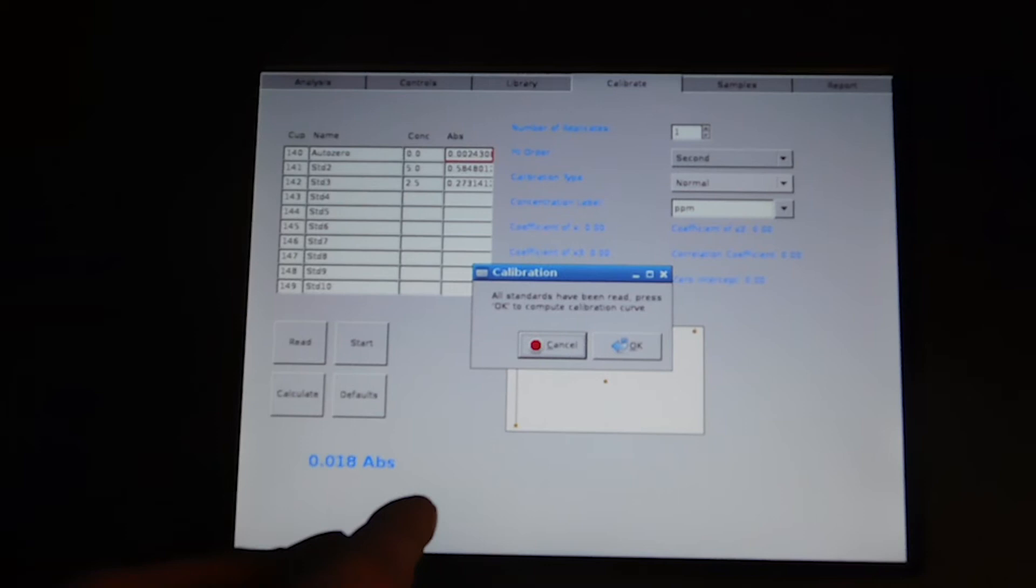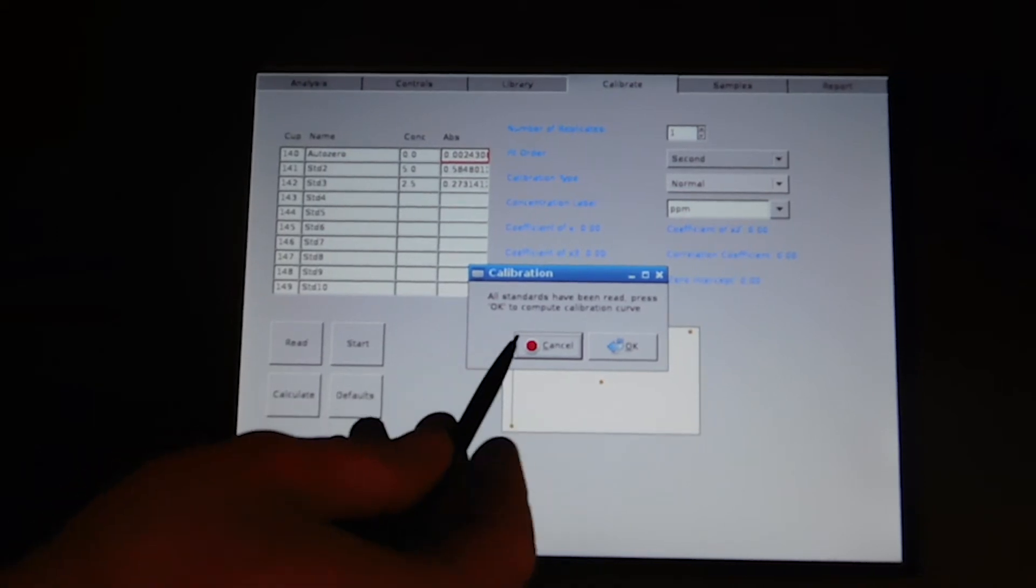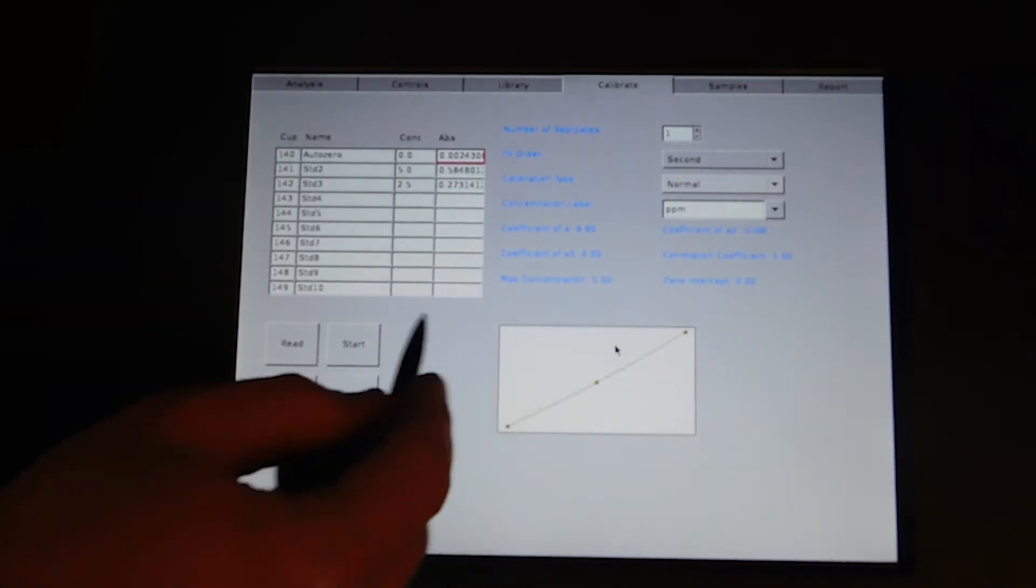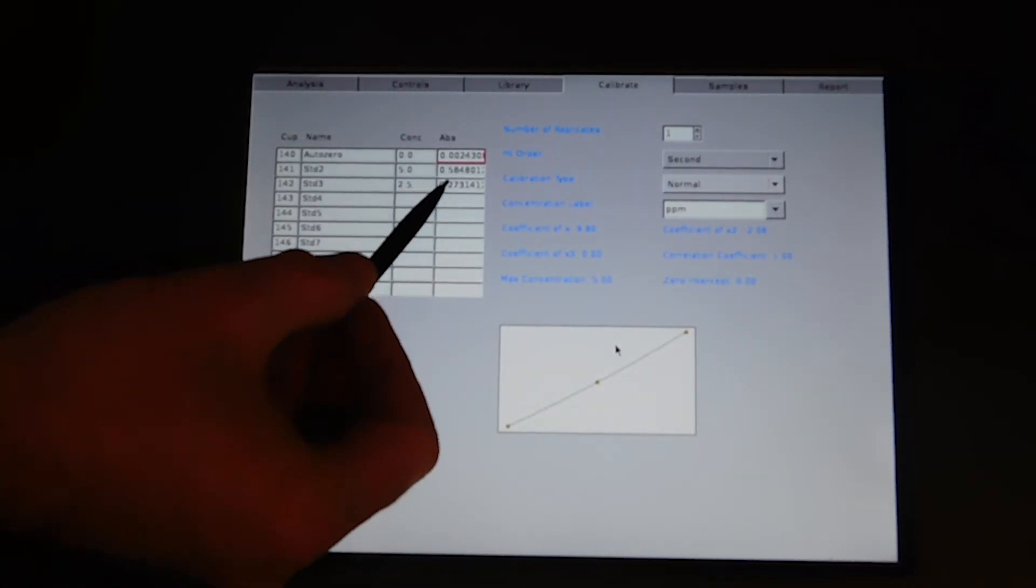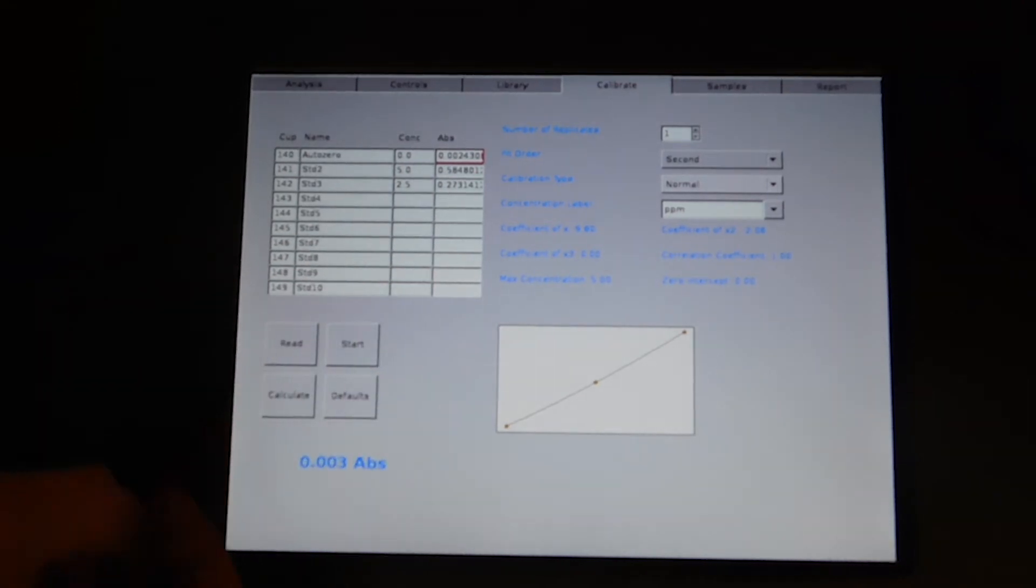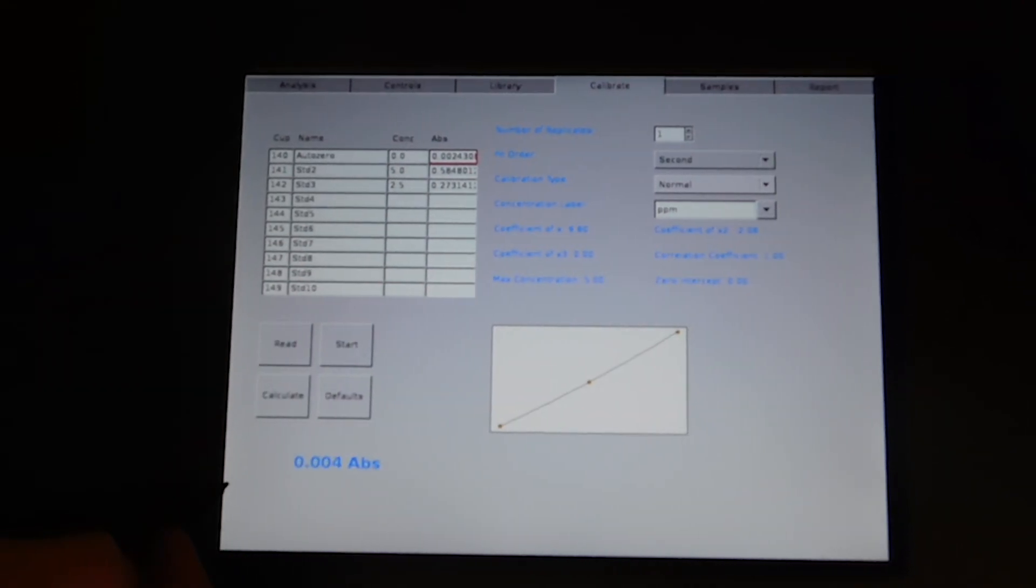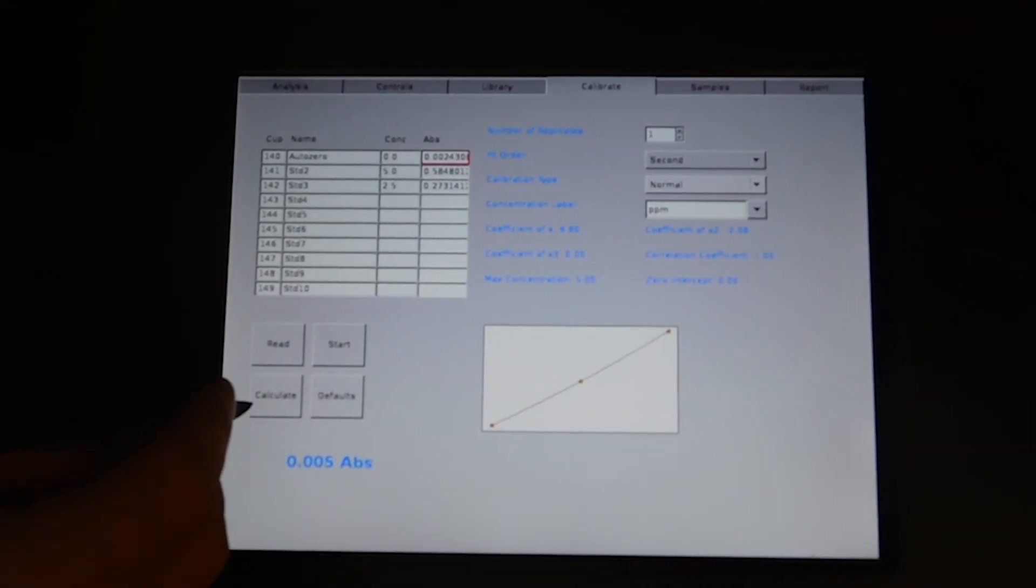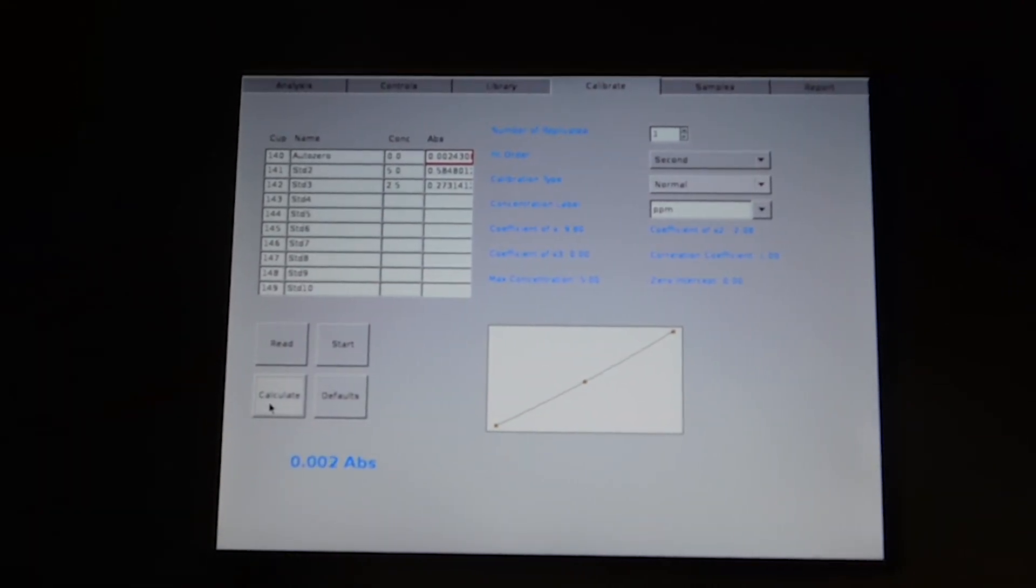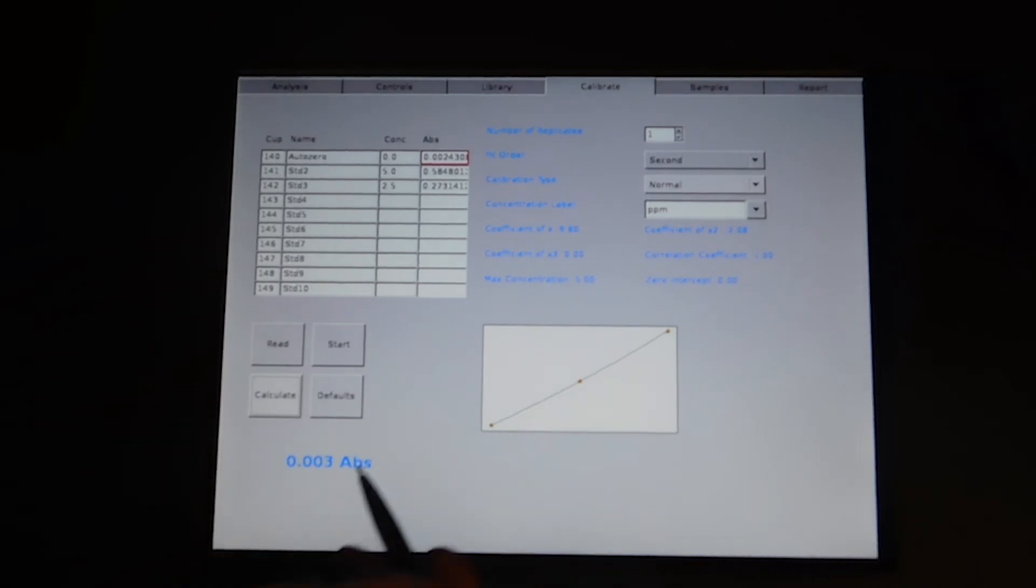You'll get the message to say your calibration is complete. Your absorbance values are listed on the right side of the table. And you press calculate to draw the curve.